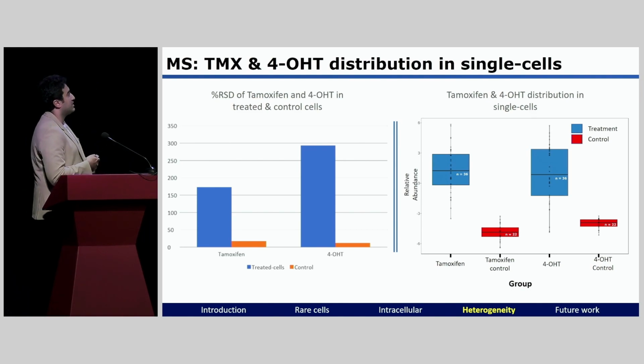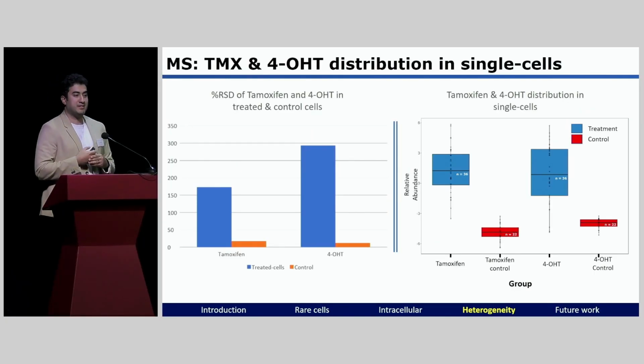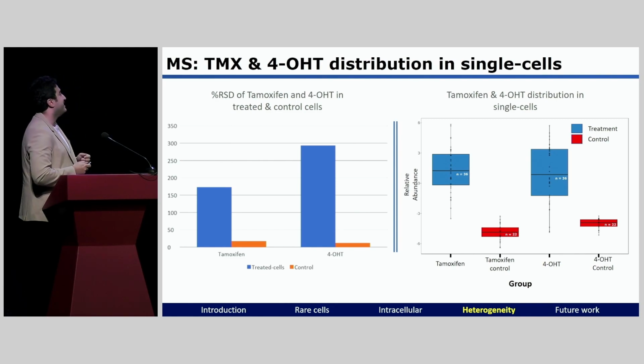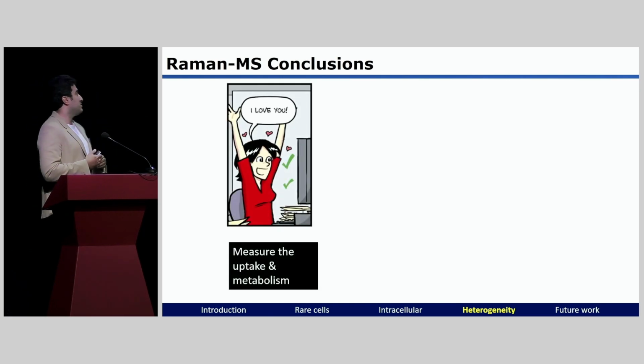We worked here with, at least from the mass spec, not a lot of cells, about 36 or so, and I'll come back to this later. We designed another experiment, went back to Japan and measured about 400 cells. And frankly speaking, I've been scared to look at the data. So again, I looked to Timothy for this and his talk. It gave me a lot of courage, and I'll talk to him later about how we correlate this data set.